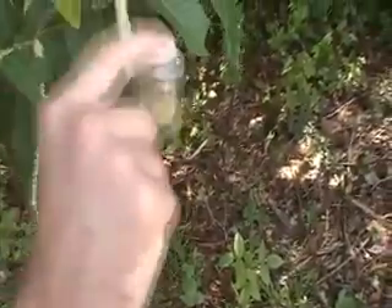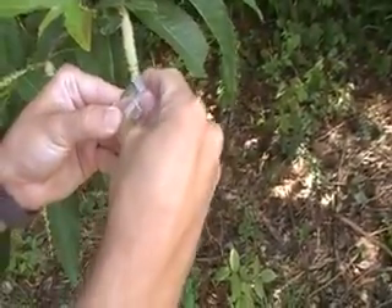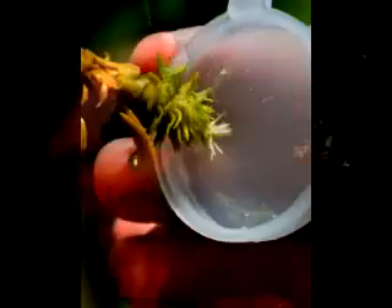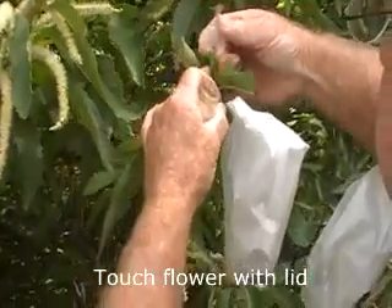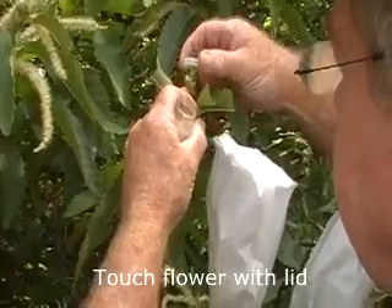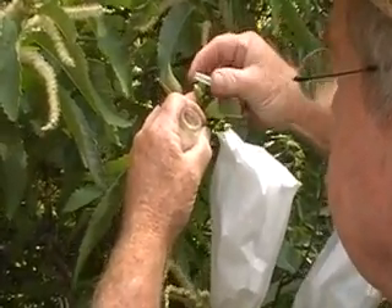If you shake the vial of pollen, you can get a layer of pollen to deposit on the lid of the vial. Then you can use the lid of the vial to apply the pollen to the stigma of the female flowers. Put the pollen and just gently touch it on the flower and it should be enough pollen.